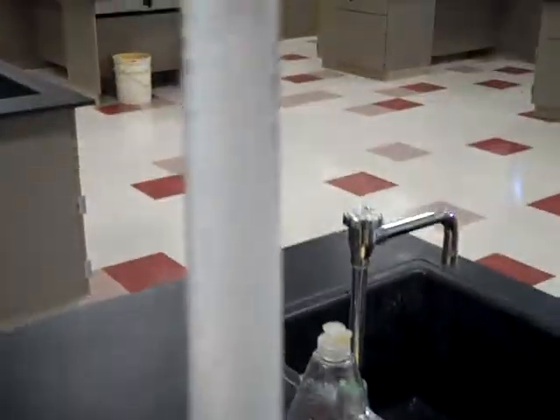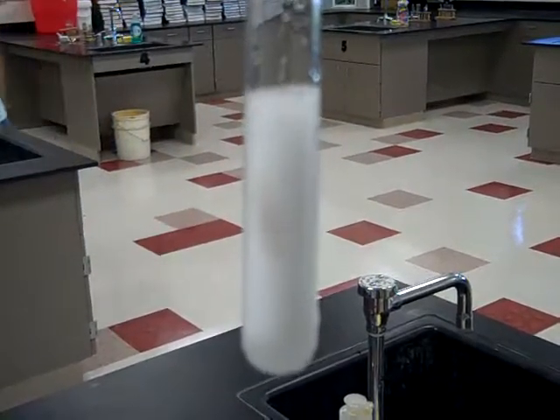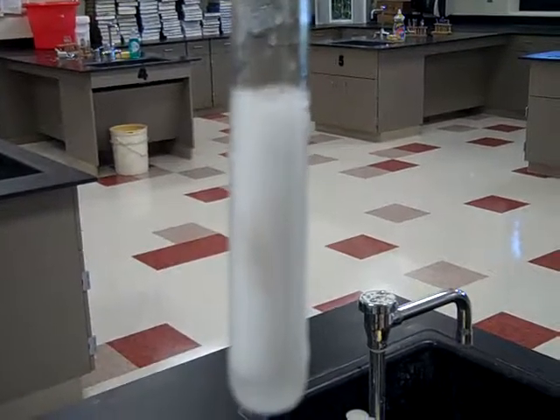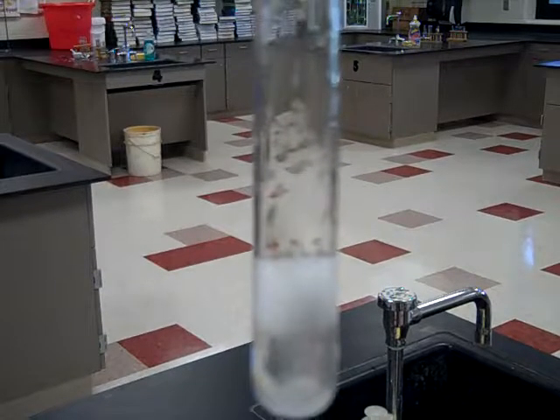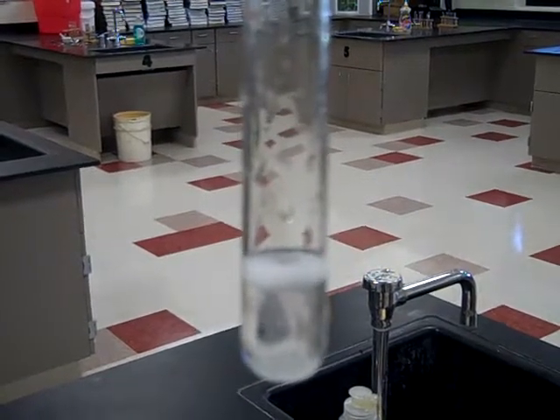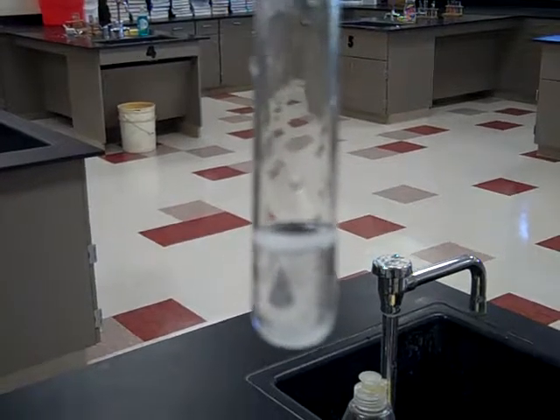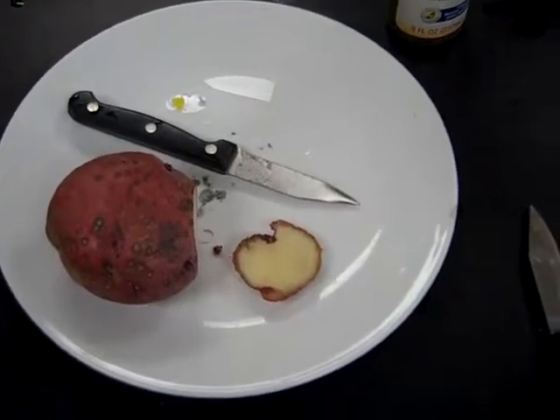Okay, see there's bubbling. Bubbles. No temperature change. Again, that is station 1, vinegar and baking soda. Okay, station 2 is potato with iodine.